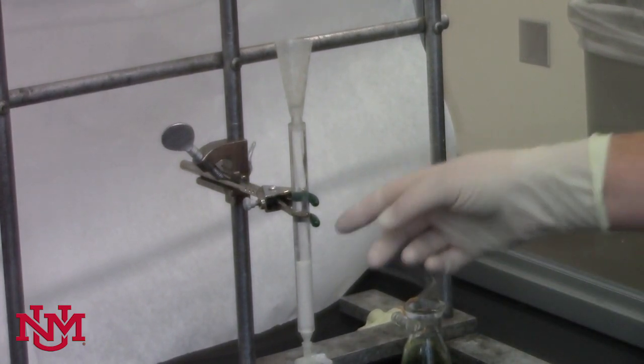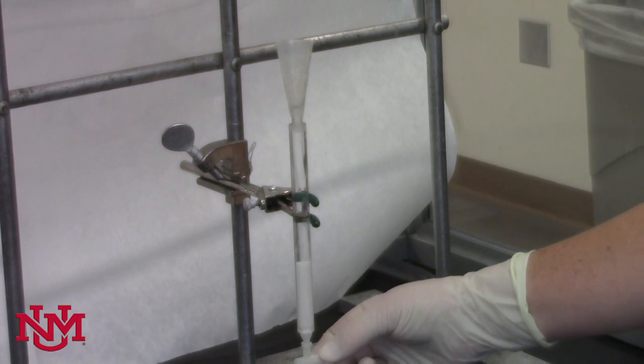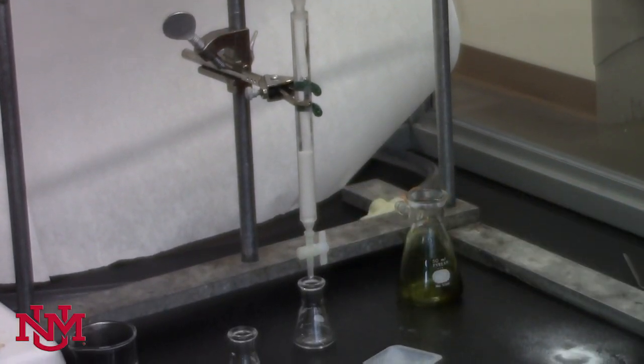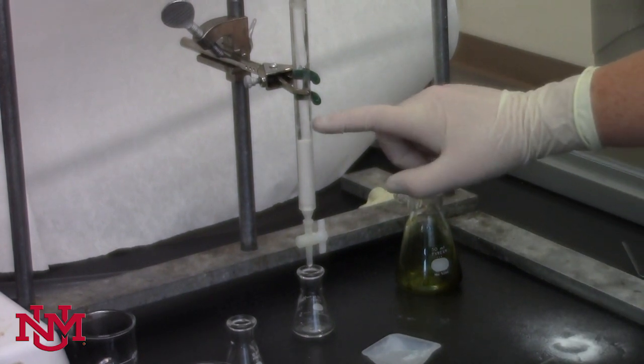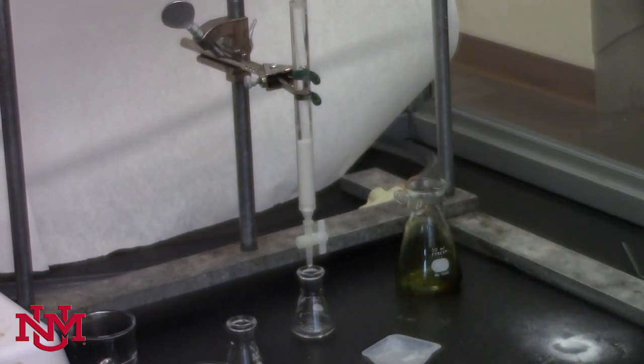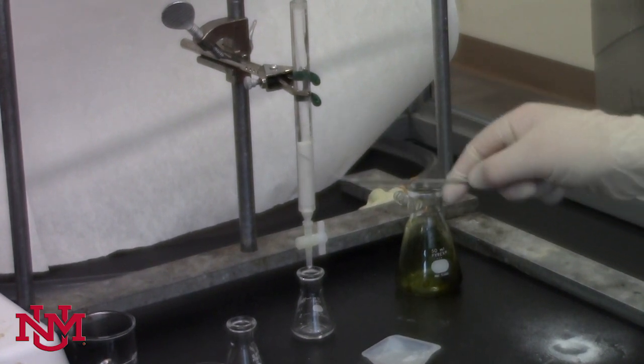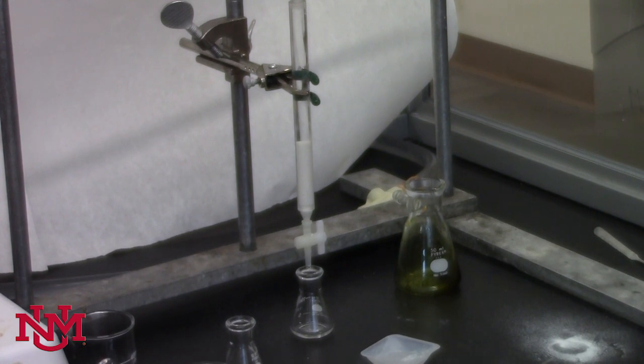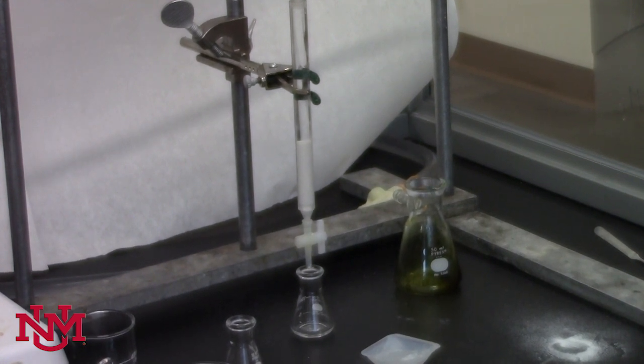At this point, we're going to take our column stopcock and open it, and just let some of that hexane drain. We want it to get until it's about maybe a centimeter or so above the alumina. We just have a nicely packed column of the white alumina, nice and even, no color yet. Then we'll be adding our green in just a little bit, and then it will change color.